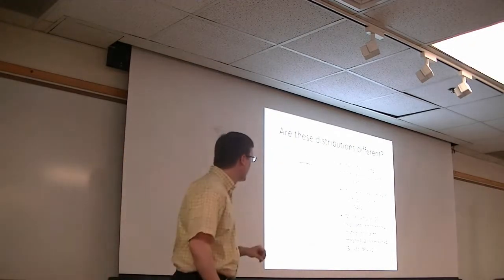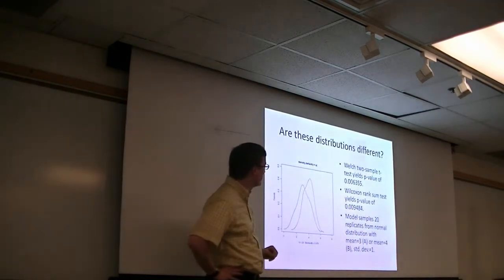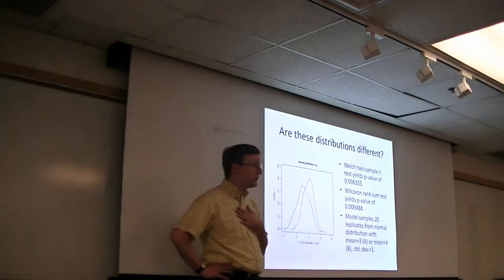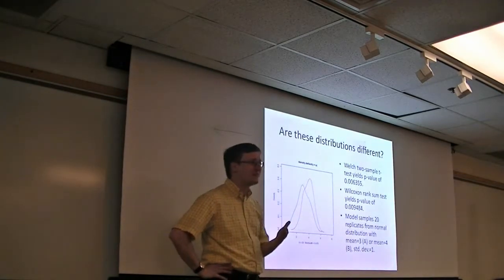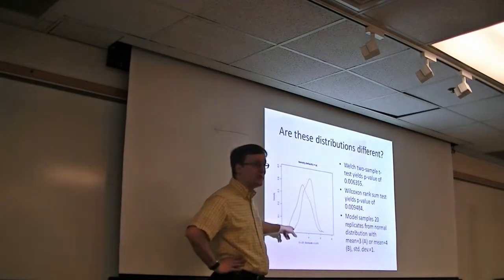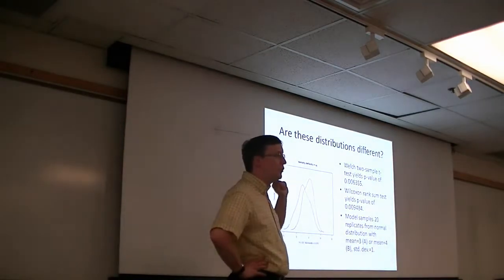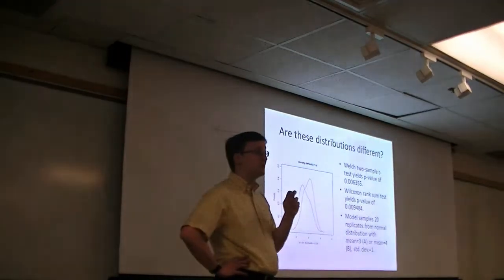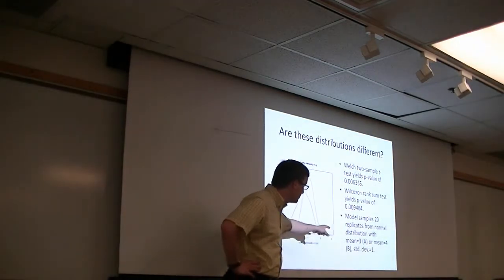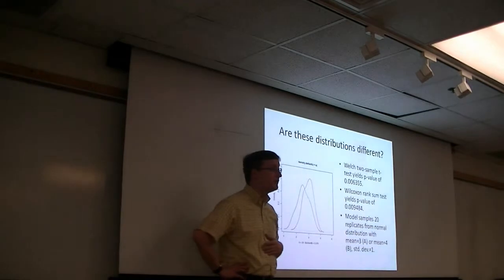So in this case, I have created a model of two distributions. Imagine a world in which we were able to get 20 replicates, right? That would be brilliant. So 20 replicates versus 20 replicates. Here I have told the software, this is R being used in this case, we are sampling 20 peaks from two different distributions, one with a mean of 3 and one with a mean of 4, with a standard deviation of 1.